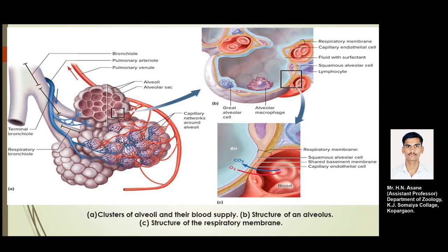That alveolus shows the respiratory membrane, where the gas exchange actually happens. The structure of the respiratory membrane is shown in the further slide, that will be C.